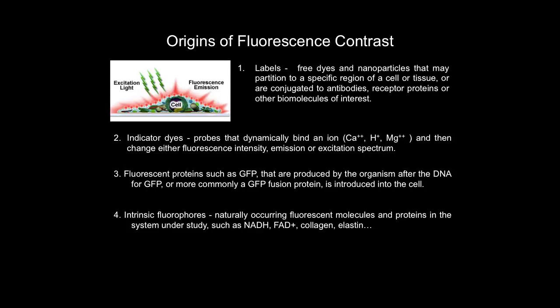And these are some origins of fluorescence contrast. We use labels, which are free dyes or nanoparticles that attach to different components in the tissue. You can label the nucleus or the cytoplasm or some specific component. Oh, go ahead.